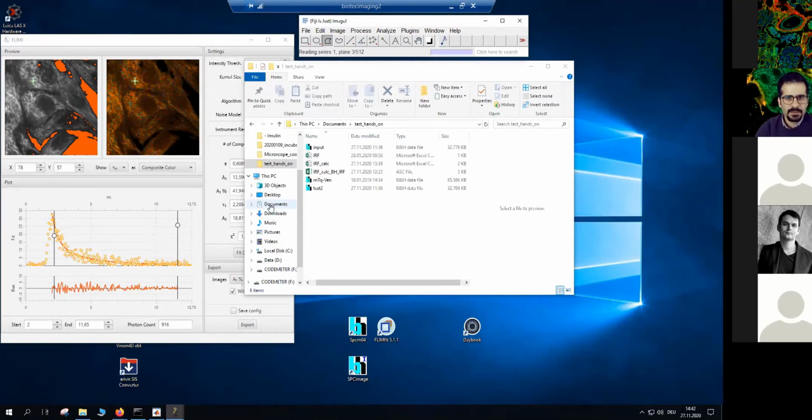Okay. The point I also have to make is that the PC I'm working on is one of our image processing systems. It's not a normal laptop, not even a normal office PC. It's a system that we use on a daily basis in the facility to analyze data. And this is how long it takes to load one of the SDT files that we have. So it's very, very important to implement this, because I can open the same data when I'm using SLIM Curve and it's super fast.